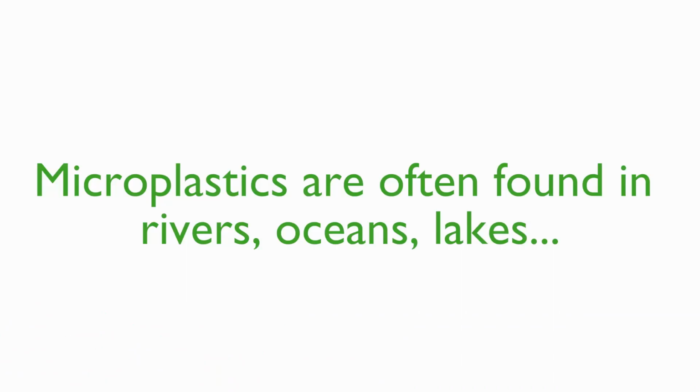And today I'm going to be talking about the different solutions that we offer to measure microplastics. Microplastics are considered an issue and an environmental concern because they can be present in different bodies of water, like seawater and fresh water.